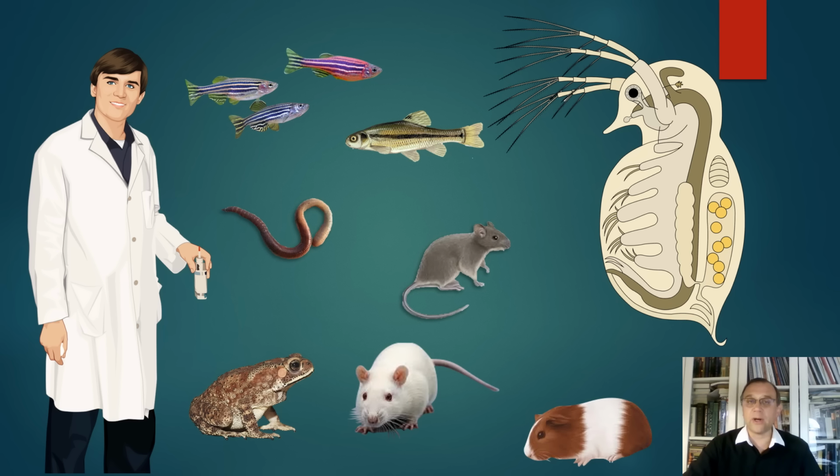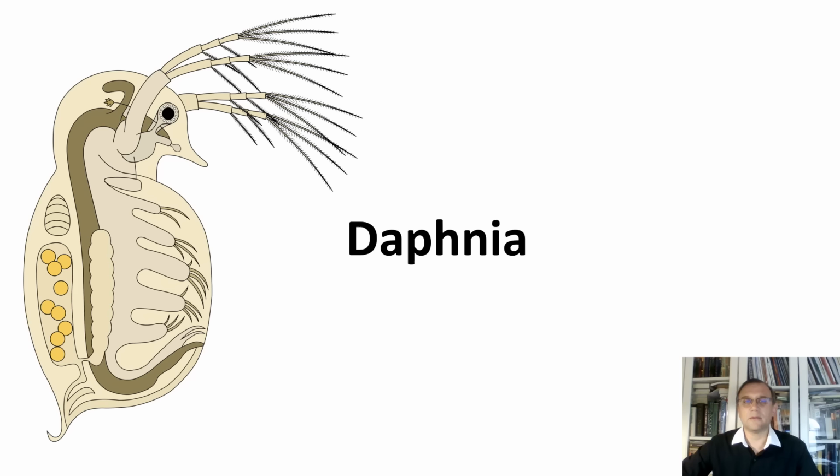We and those organisms all belong to the same kingdom, Animalia, and our bodies are made up of similar cells. Those organisms are used because it is easy to maintain and breed them in laboratory settings. However, scientists have to run preliminary experiments before verifying which of those organisms will or will not suit the purpose of their investigation. Today you will run an experiment with Daphnia.